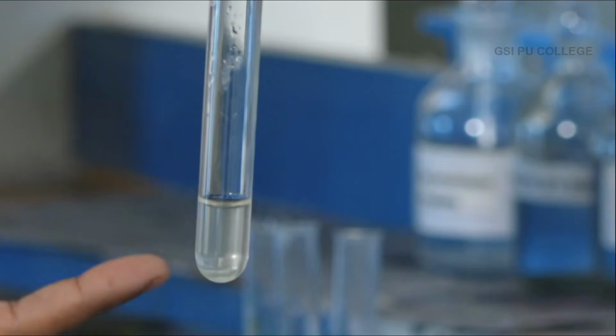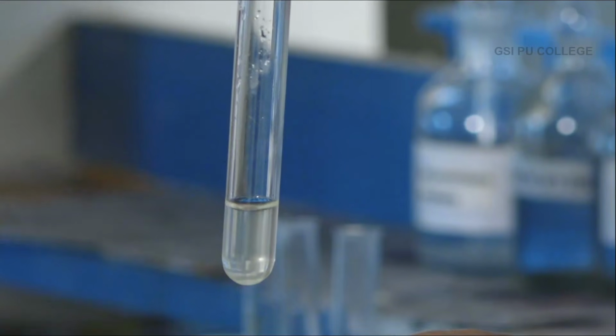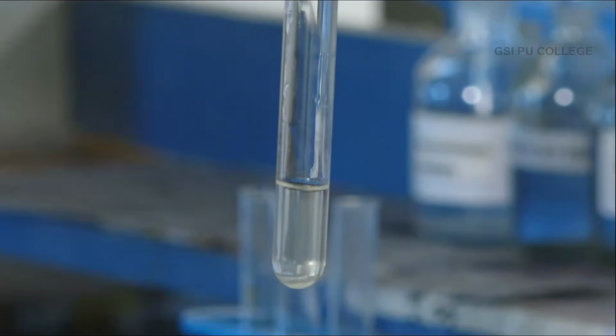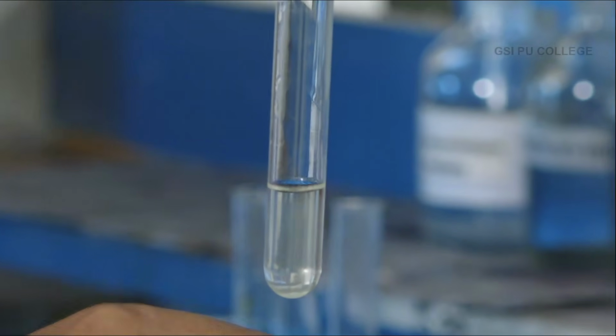For strontium, take a small amount of your original solution, add dilute acetic acid. Now, add ammonium sulfate solution.